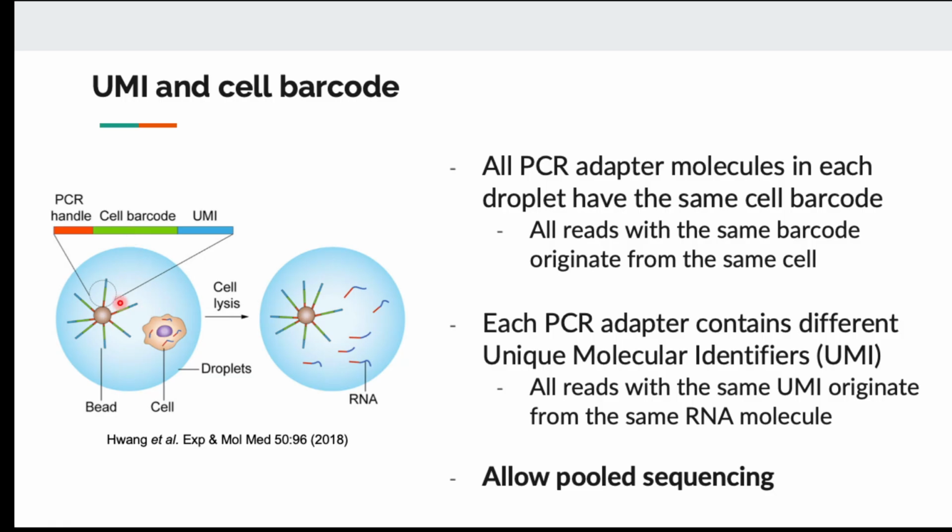Another feature that they add with single cell sequencing is, so we learned from the transcriptomic session that when we do RNA sequencing, we PCR amplify the RNA, so we can have amplification bias. Some genes are amplified better than others. So the read count has this bias added. The best thing you can do to count gene expression is to count the number of molecules. And we saw this with the NanoString technology. They attach the fluorescent probe to individual molecules of RNA. So you have the molecular count, not the read count.